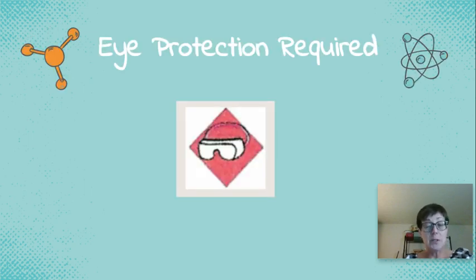You are required to wear eye protection when I ask you to. Not all of our labs will we need to, but those that we do, once we start the lab, you are expected to wear those goggles the whole time. You're only given one set of eyes and we need to protect them.